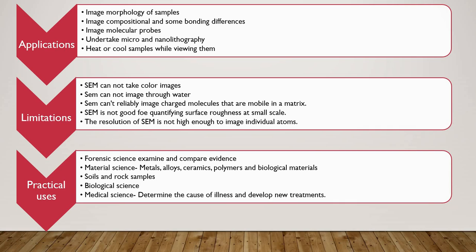The resolution of the SEM is not high enough to image individual atoms. Elemental analysis below micron scale. So these are the limitations of SEM. Then practical uses for the SEM. Scanning electron microscopy is used in all scientific fields, in engineering, archaeology and even in art.